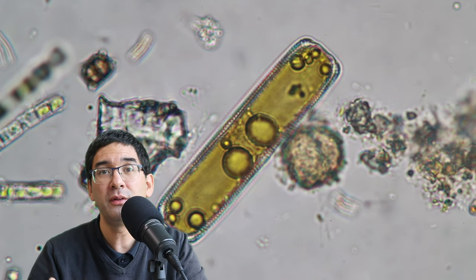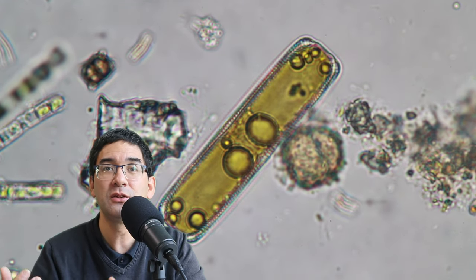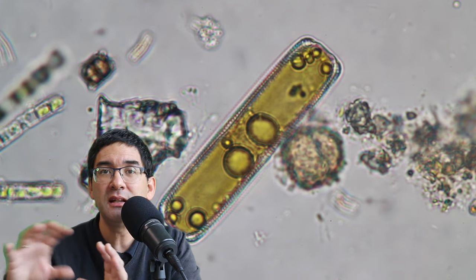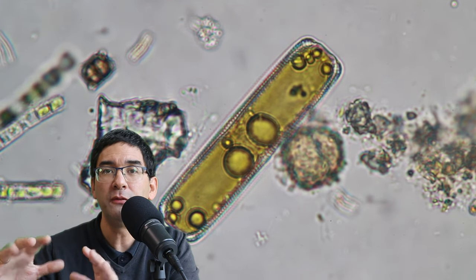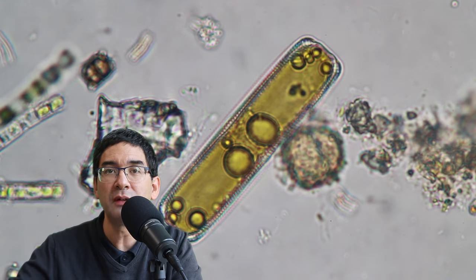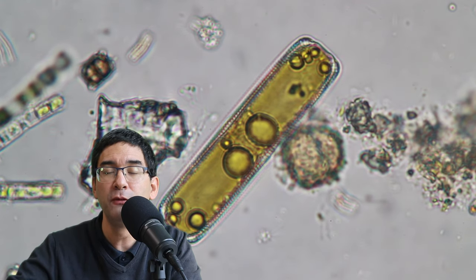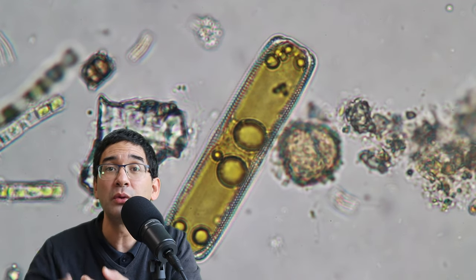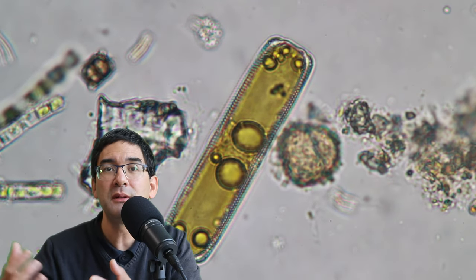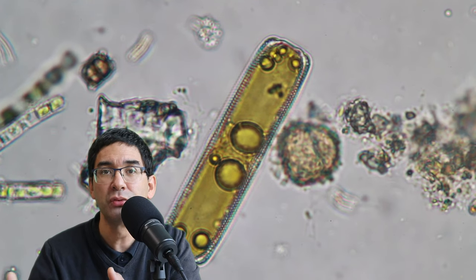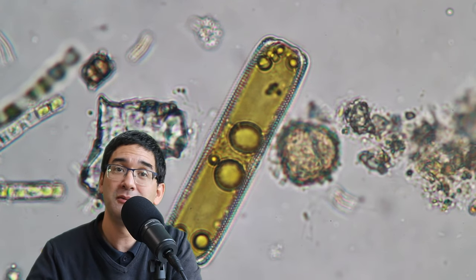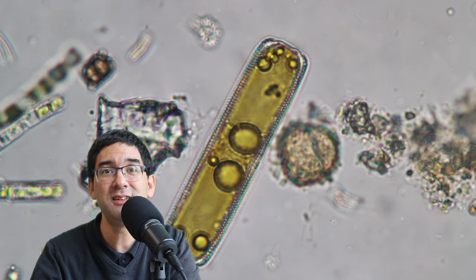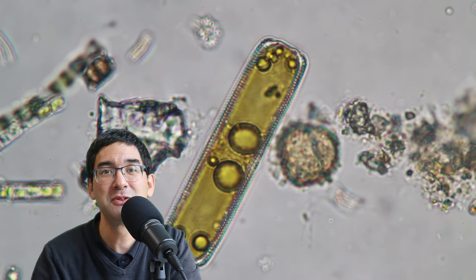And what has happened over the course of earth's history is that those diatoms that have those silica cell walls, when they died off, then they settled on the ground and on the sea floor or on the ground of lakes. And they got compressed into the ground and then all of the organic material decomposed. But the silica cell wall, the so-called frustules, they survived over the ages. And these are the ones that we're now able to see.